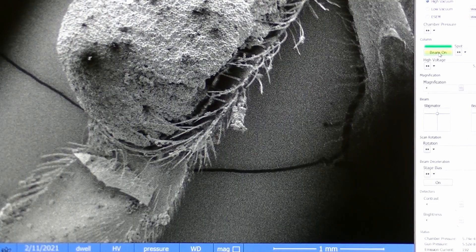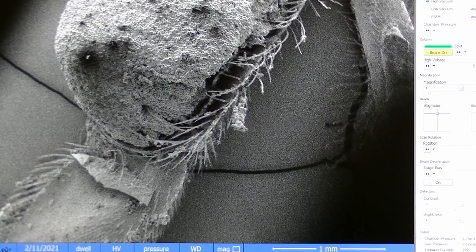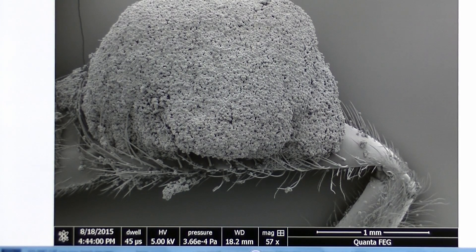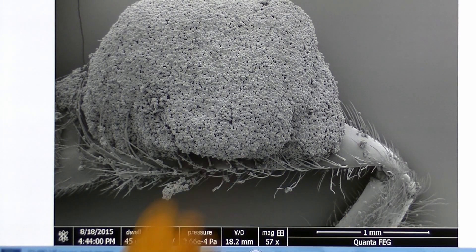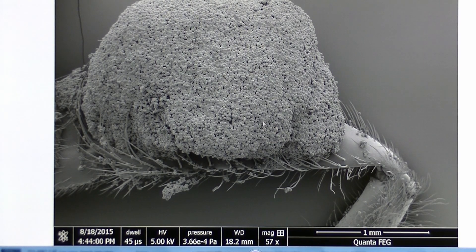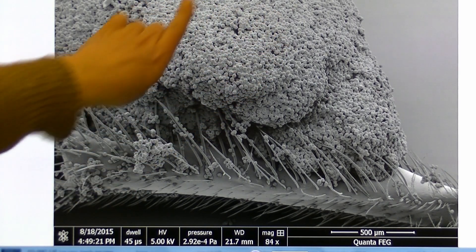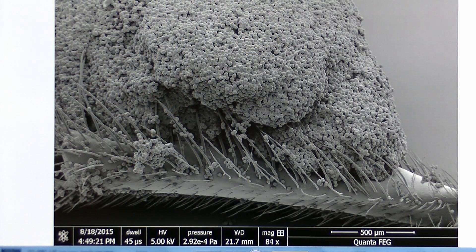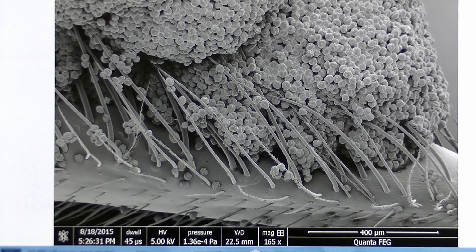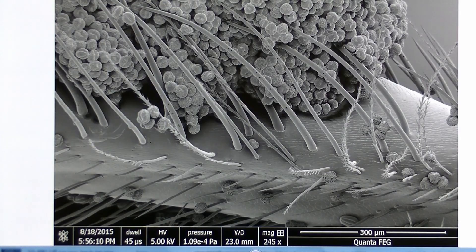The sample that we're looking at today is a bee's leg. The scale bar here allows us to see the size of the sample. Increasing the magnification we can see more detail in the surface of the sample and we begin to see that this area is made up of lots of small particles. These particles are pollen grains.